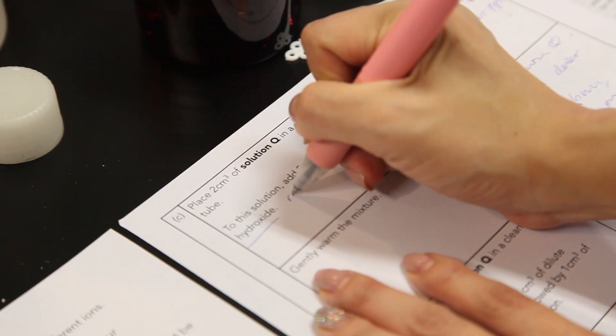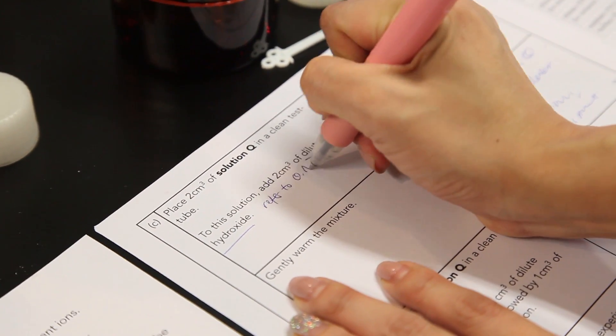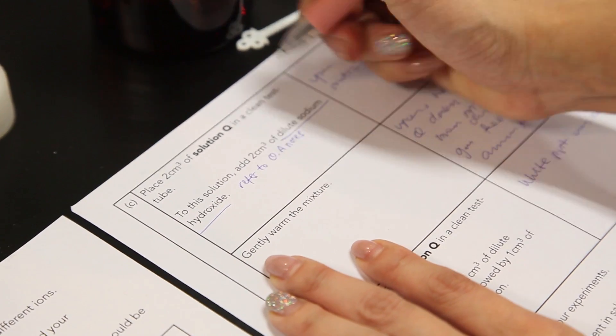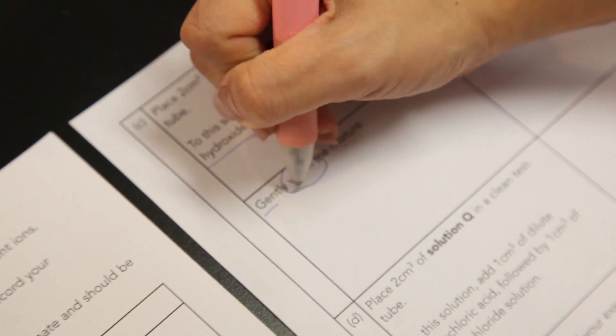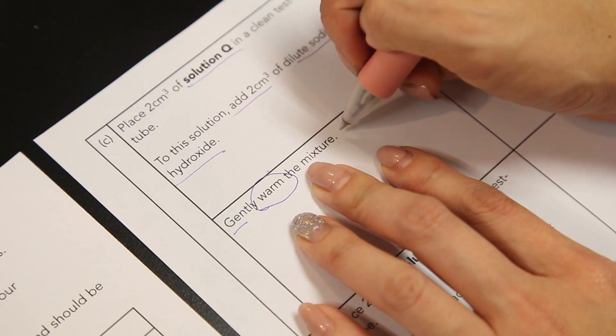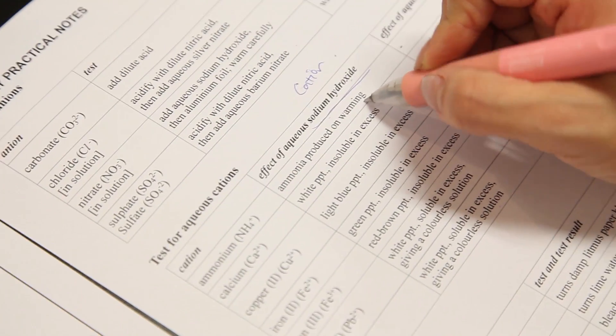Whenever sodium hydroxide is added, refer to QA notes. Over here, sodium hydroxide, cation test. Gently warm the mixture. When you warm the mixture, the only one that requires you to warm is ammonia.